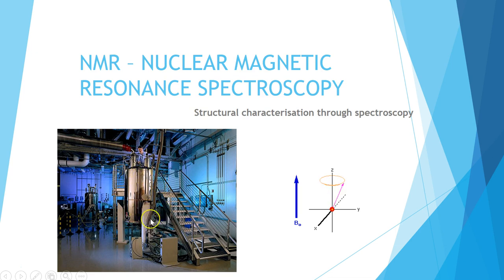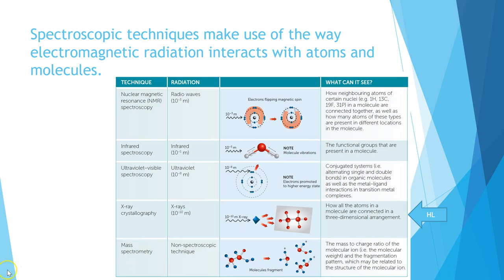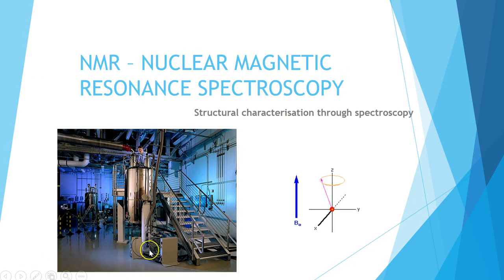It's a bit older. What we can see down here is the little towers, which are where the radio frequency is set in. And then this is the idea of a spinning nucleus that interacts with B0, which is our magnetic field. But let's start having a look.